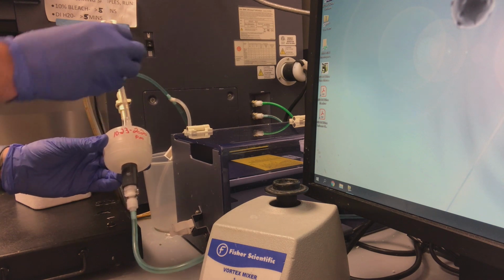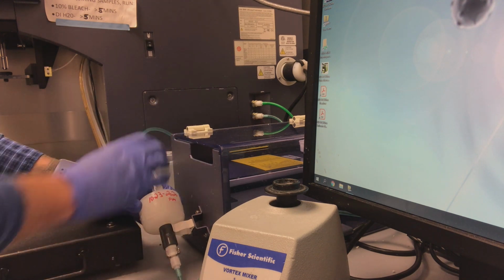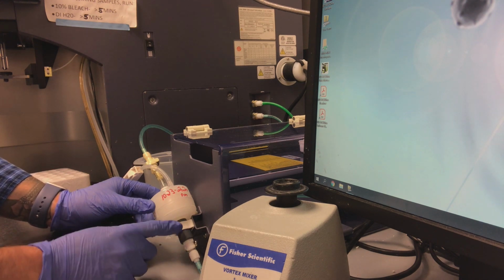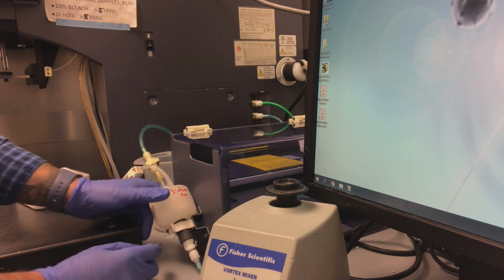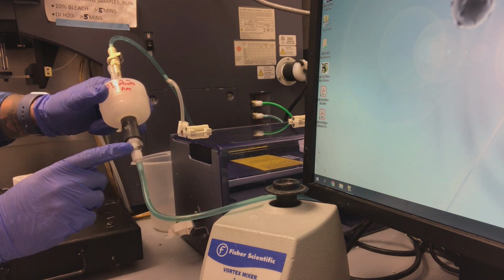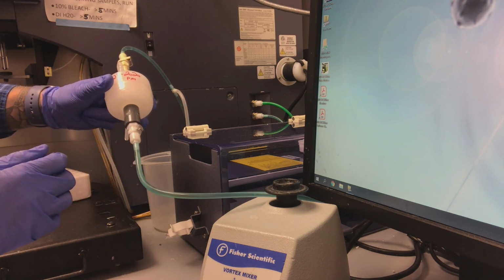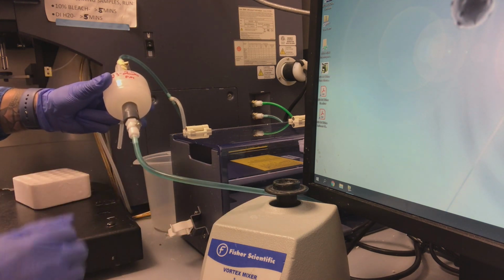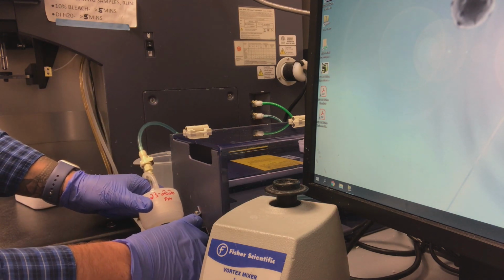With the tube pointing towards the ceiling, you can install this back into place here, with the clips only touching the very dark gray material. Please do not allow the clips to go over the white connection here, because it can become disconnected. Make sure that that is always connected there before moving on to any next steps.